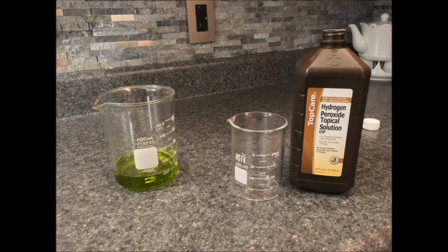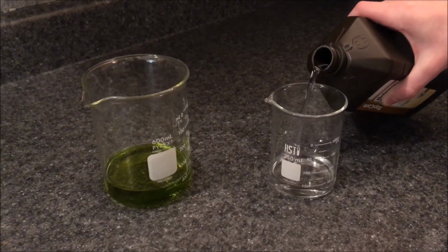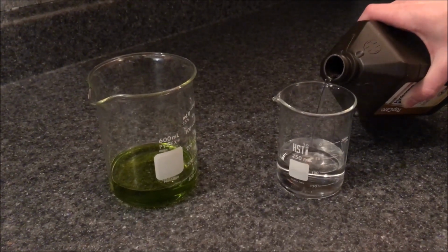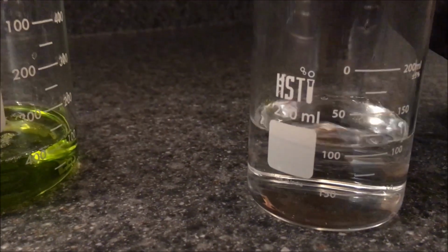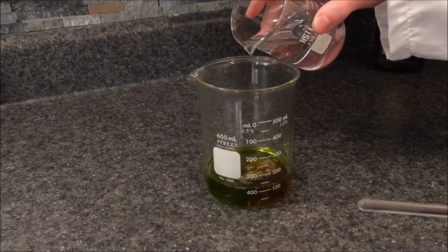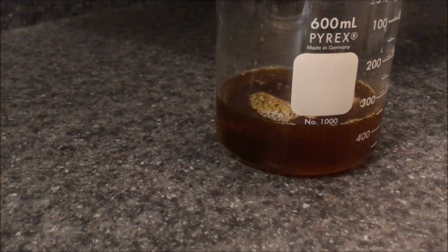Next, we will have to change the iron 2 chloride into its third oxidation state by adding around 110 mL of 3% hydrogen peroxide into the solution. You could use a higher percentage of hydrogen peroxide if you have it, and then there wouldn't be as much water to evaporate. Adding the hydrogen peroxide to the iron chloride solution will generate a small amount of heat.